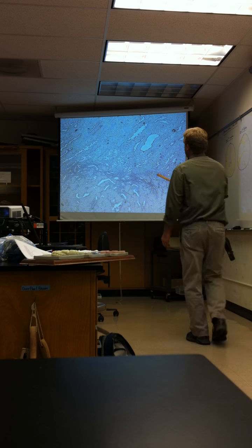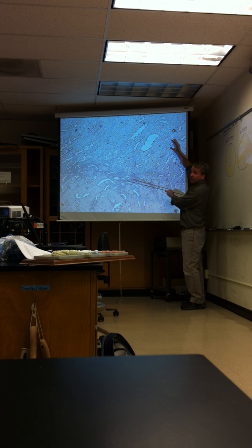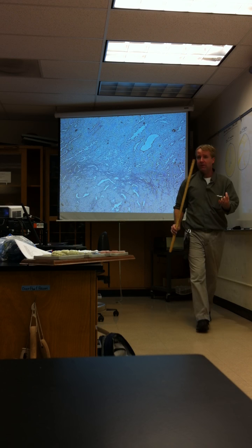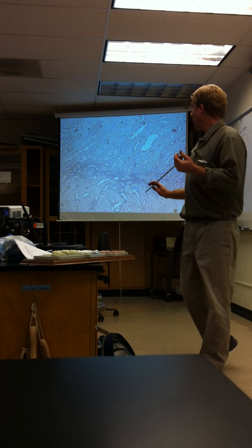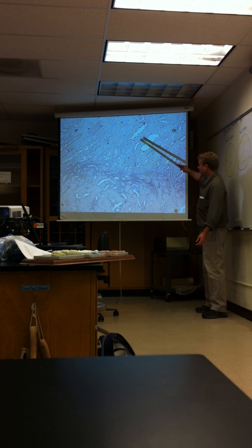And so you could have these stratum basalis growing outside of the uterus, and then they would grow a stratum functionalis, and then this tissue would die in the pelvic cavity. That would cause a lot of pain. And so there'd be bleeding and pain outside of the uterus. And so when you're looking at that stratum basalis, stratum functionalis, you can kind of think also of that endometriosis, where you have that tissue outside of the uterus. And if you're given the uterus slide, it would look something like this, where you can see myometrium, endometrium.